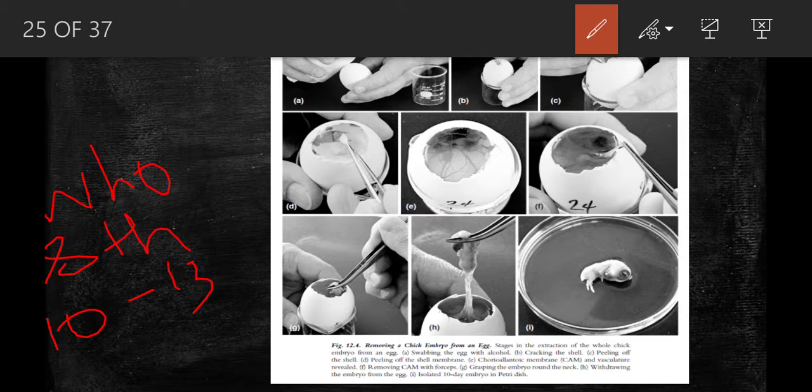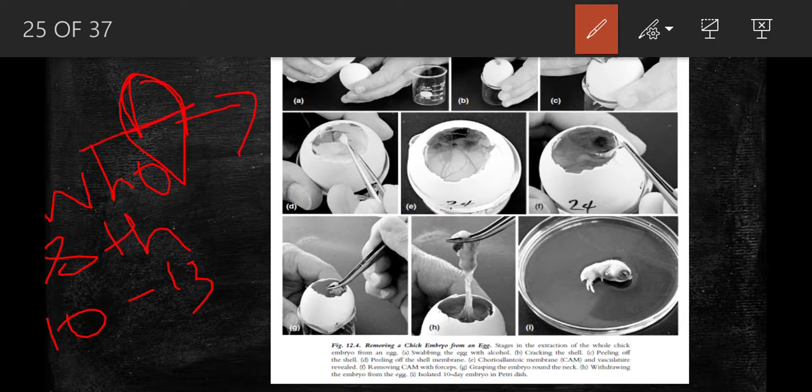Before starting the experiment, you have to swab or wipe the whole thing with 70% alcohol, then keep the blunt end in the beaker.